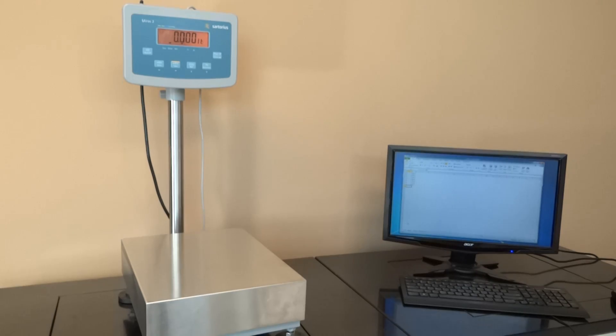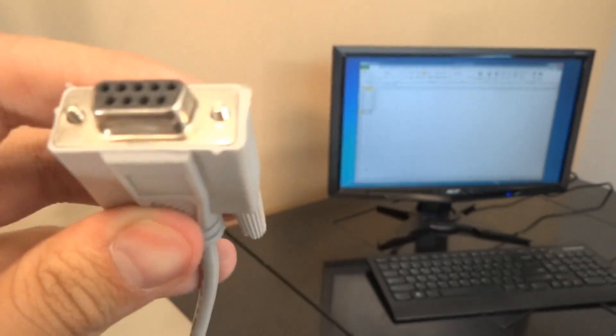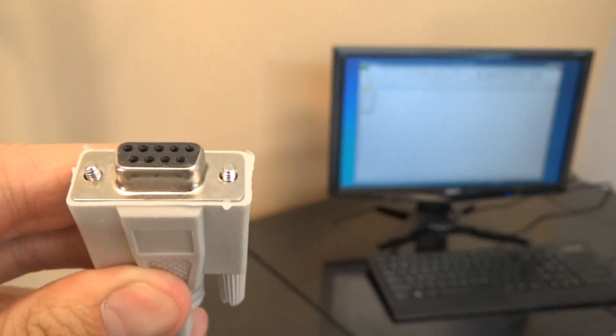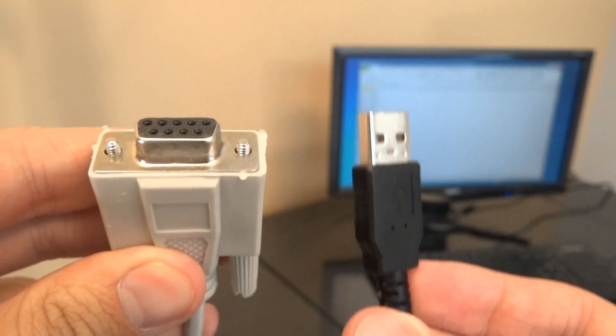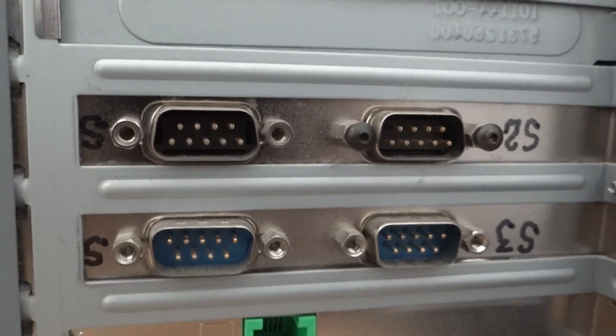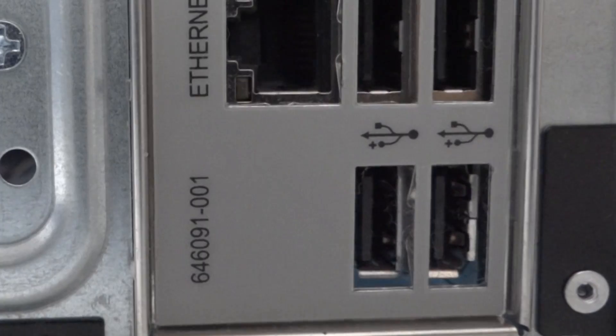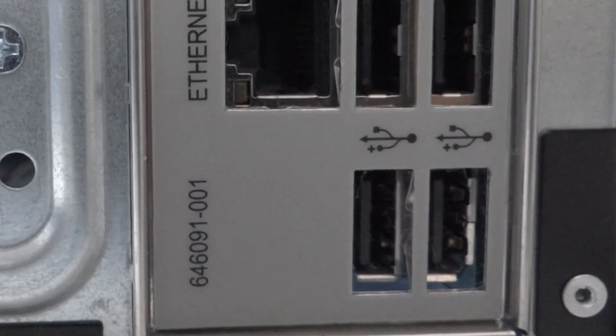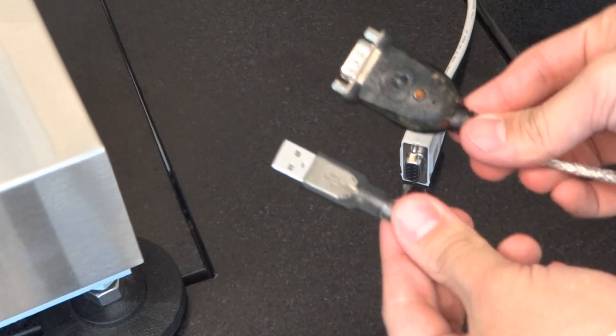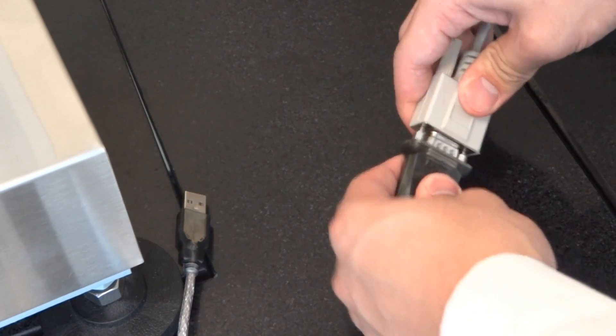This can sound quite daunting, but it is easier to implement than it looks. To connect through RS-232 or USB, your computer must have a serial port or a USB port. You may need an RS-232 to USB converter.